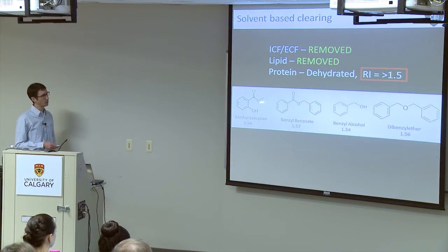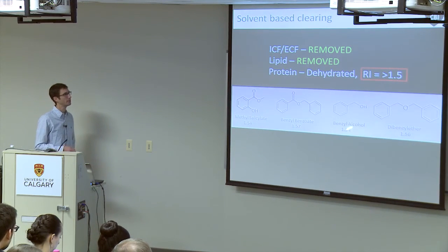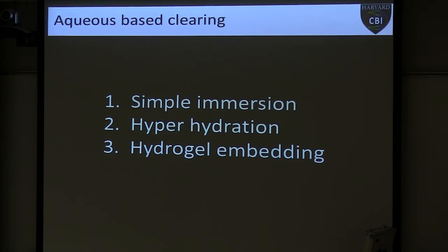These are a number of the molecules that have been used in this process, and you can see they all have nice high refractive indices around 1.5. All right. So that's solvent-based clearing.